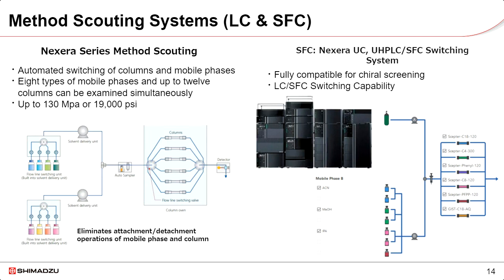When we up the ante and look at the SFC implementation within LabSolutions MD, we have the capability not only to do that same column and modifier selection in the SFC realm, but we have the ability to control the UHPLC SFC switching system. And we can, in an automated sense, accomplish both SFC and LC separations within a single or multiple enqueued batches, including changeover of conditions within the system.